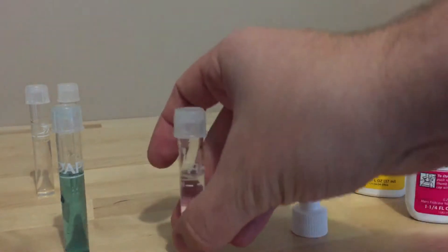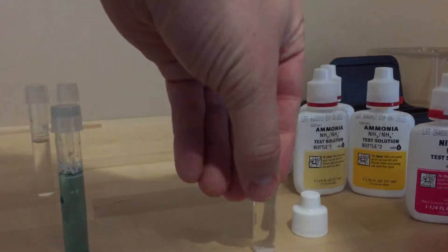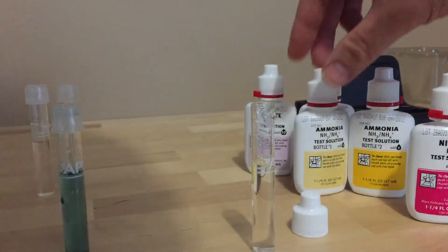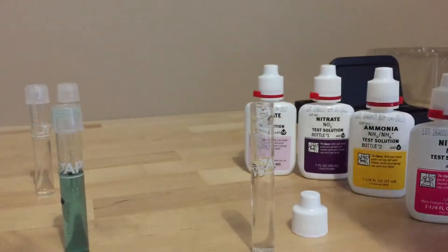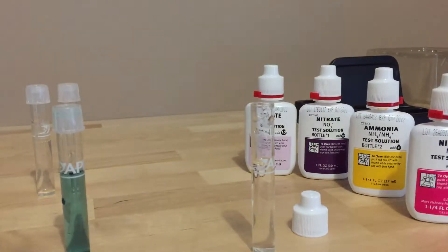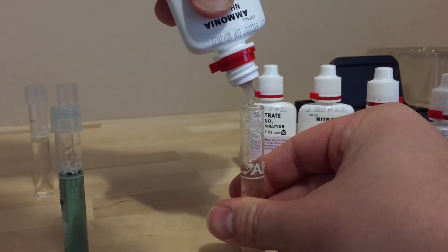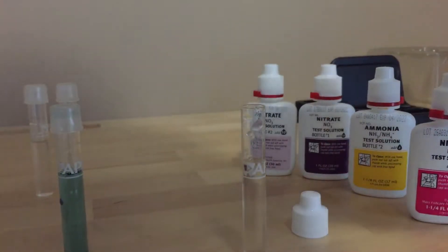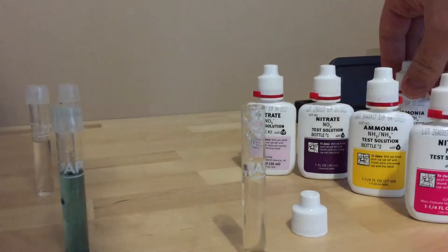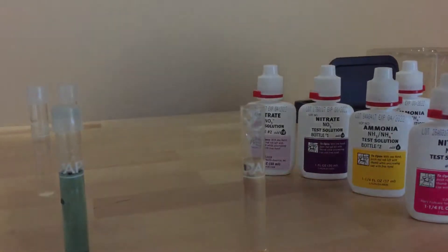So our next one we'll test for is ammonia. There's a bit more to that. If you get your ammonia bottle number one, you'll see it says add eight. So just give it a quick shake and add eight drops. And it is handy if you hold the bottle directly upside down; it helps the drops to come out more evenly.